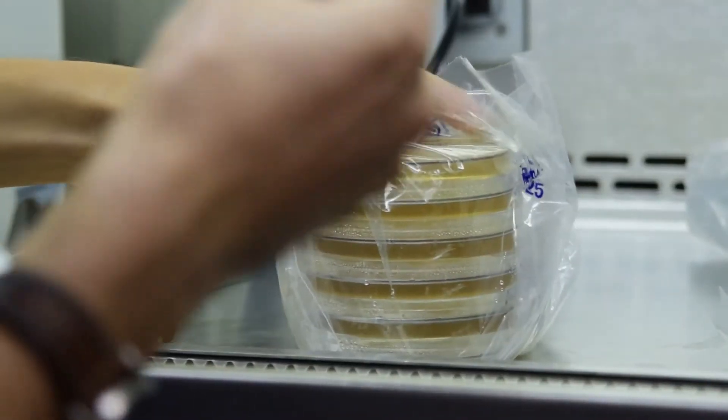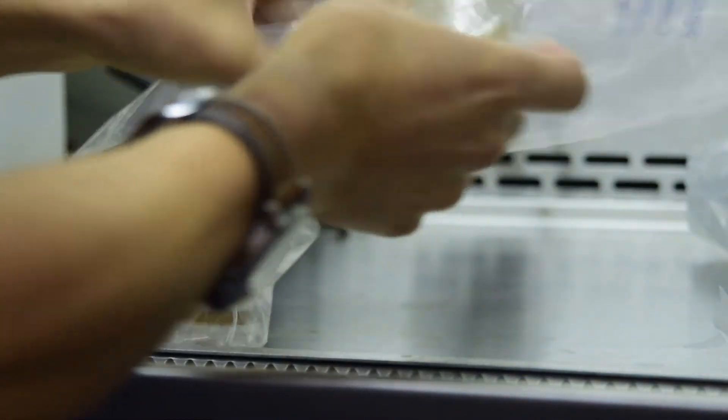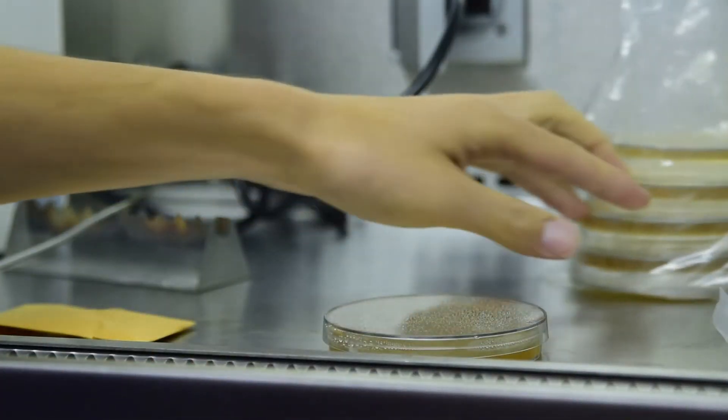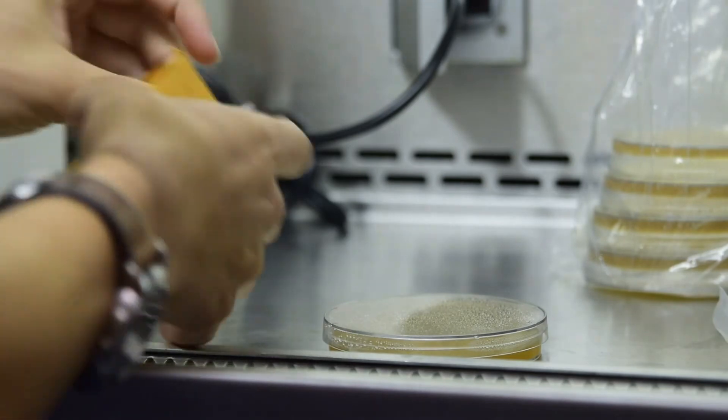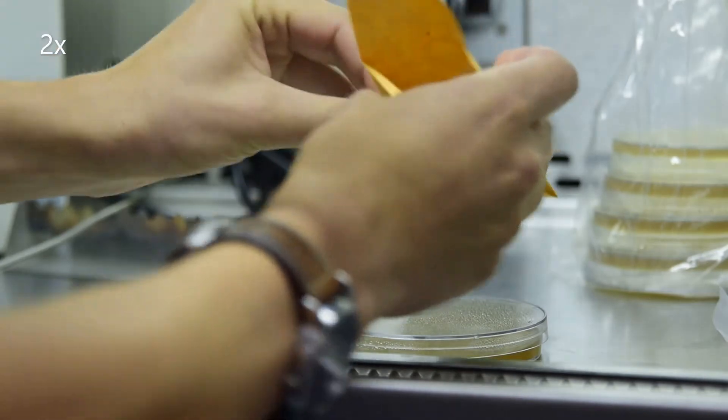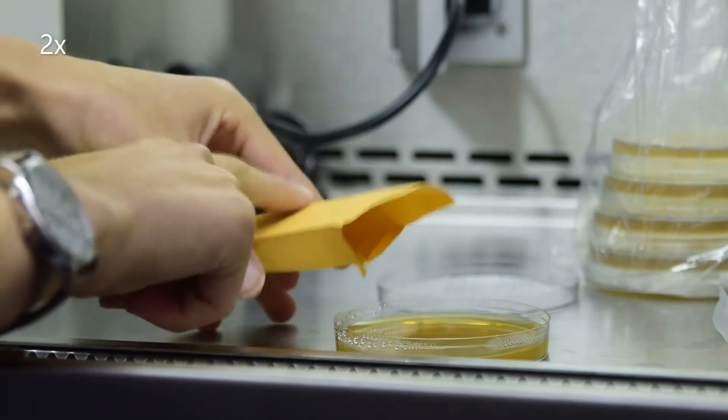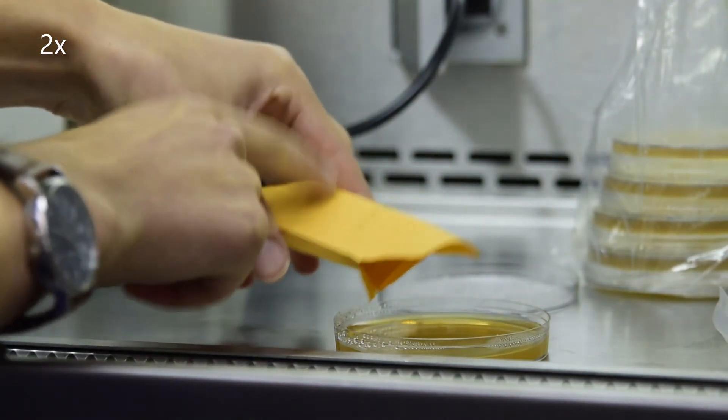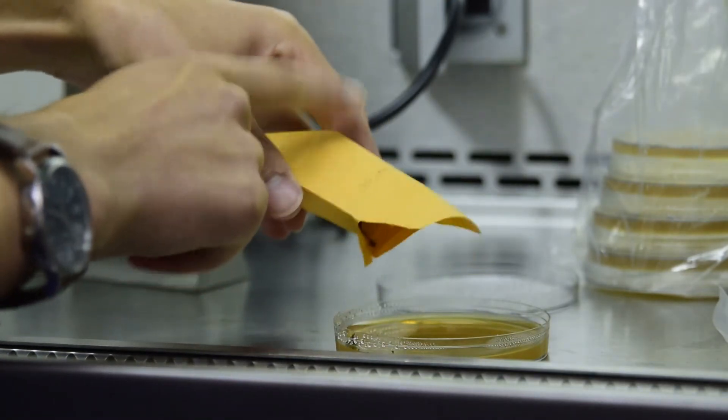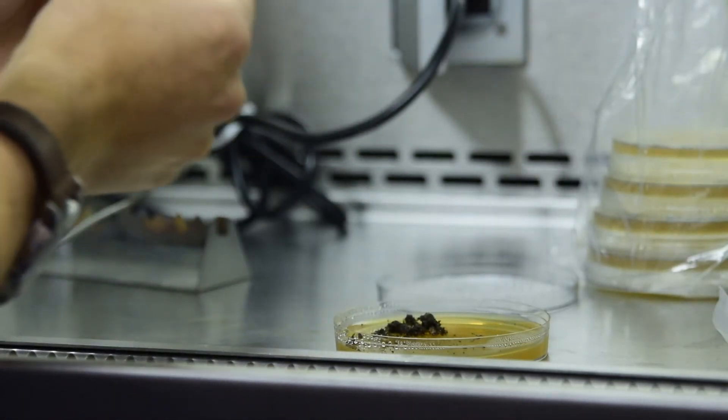The first plate is called a soil sprinkle plate. Open the soil sample envelope without touching the sample and shake some onto an antibiotic containing plate. Try to cover only a small area to allow the fungi to grow into the other areas without soil.